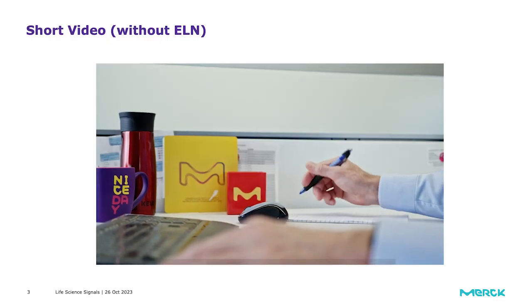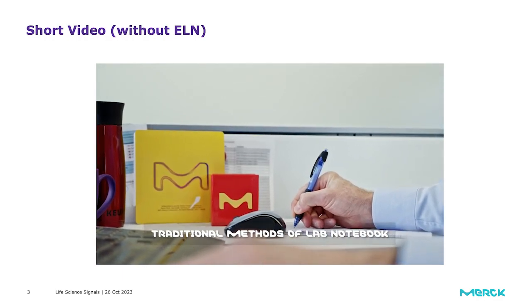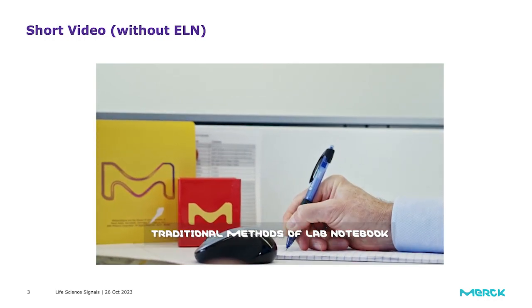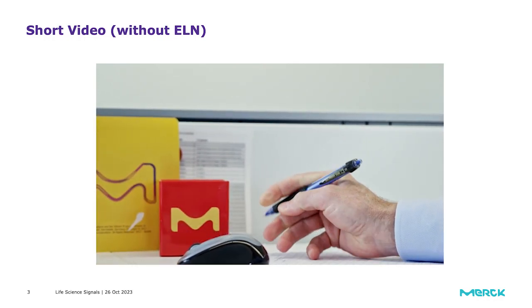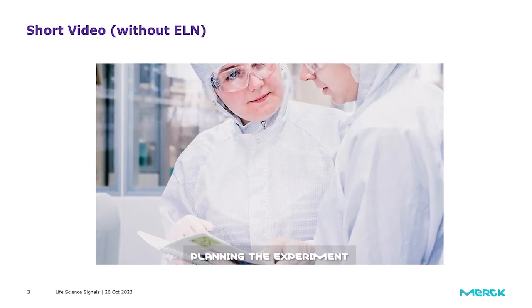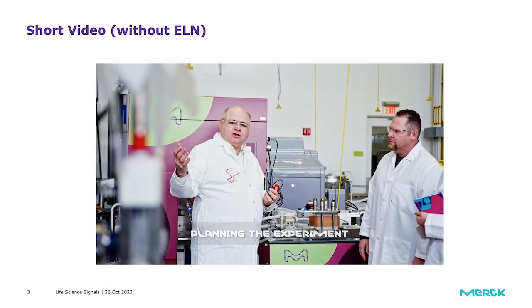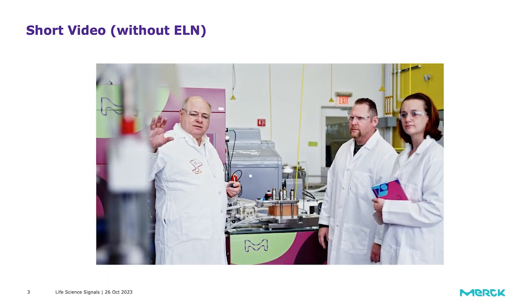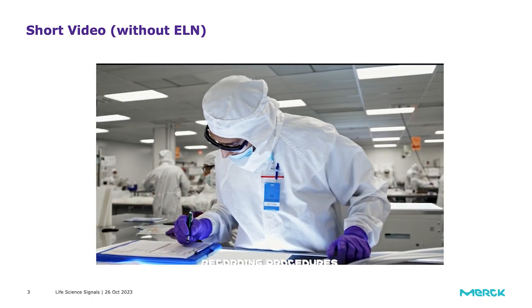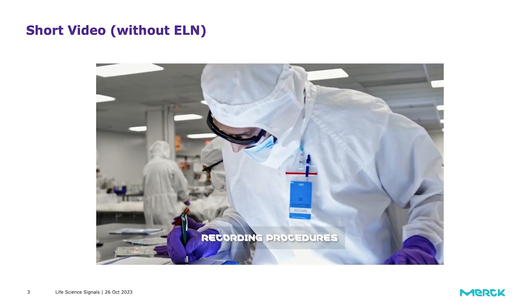A laboratory notebook is a record of the experimental work done in the lab. It is a legally valid record that preserves the details of experiments and provides a reliable reference for writing up materials and methods and results for a study. Before starting an experiment, write down the objective of the experiment, procedure plan, raw materials and instruments to be used in the notebook. During the experiment, write down a clear record of the experiment procedure, including detailed steps, measurements, and any controls or variables used.